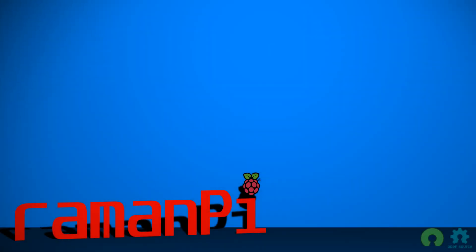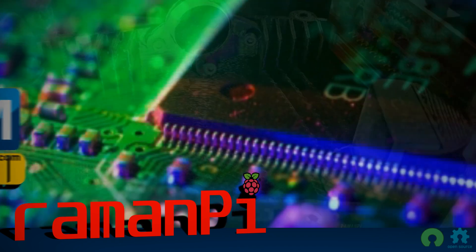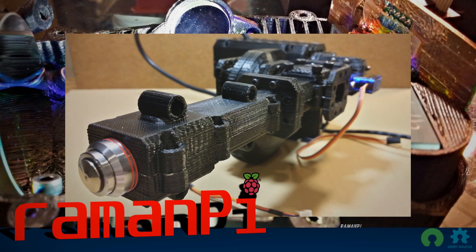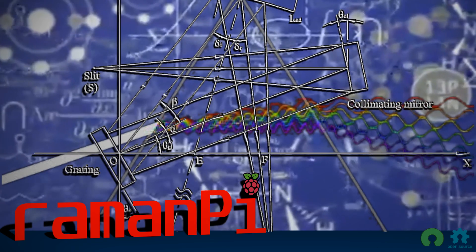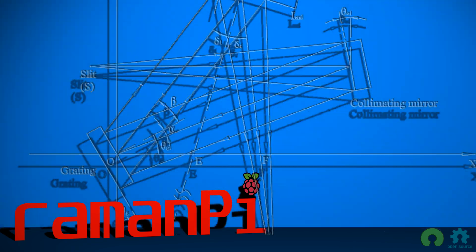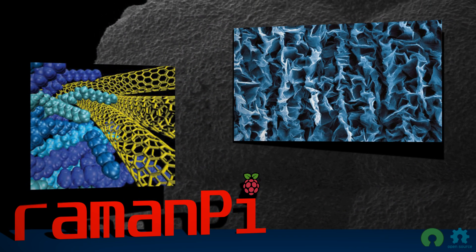Ramen Pie is a benchtop Raman spectrometer constructed from very easy-to-source components and 3D parts capable of being printed on even entry-level printers. Complicated physics aside, Ramen Pie provides valuable information about a wide range of materials.